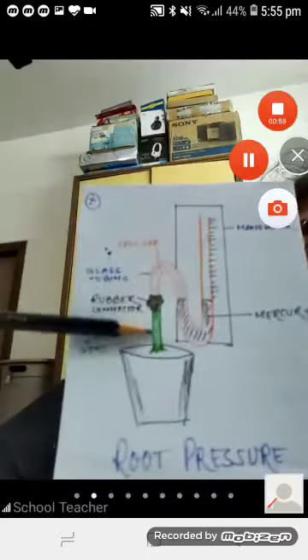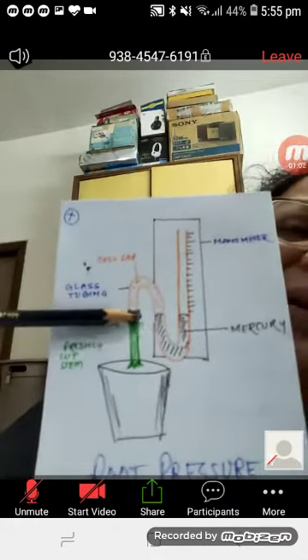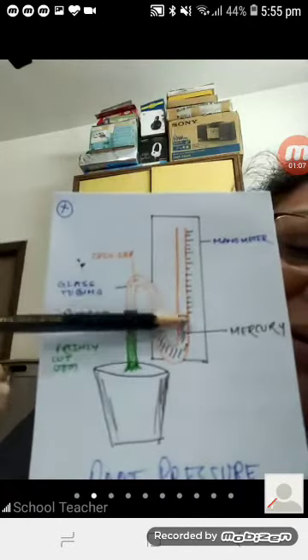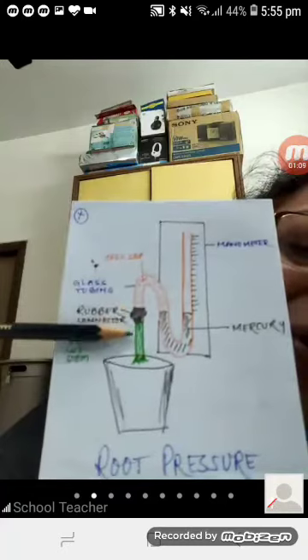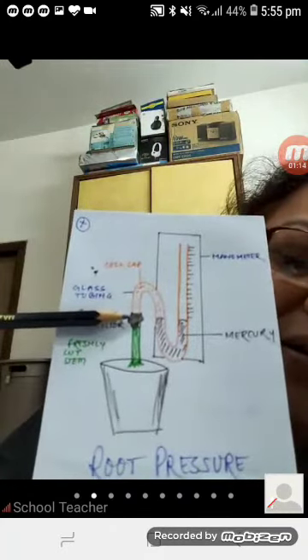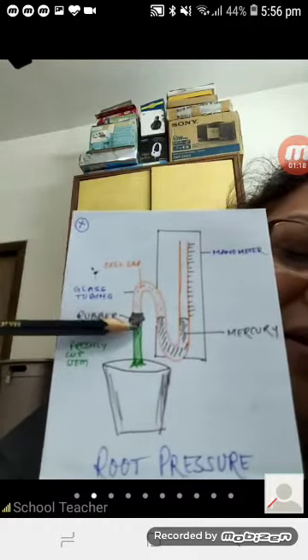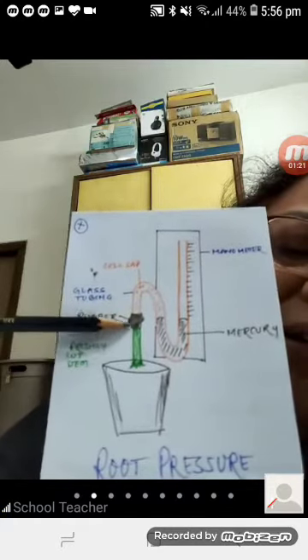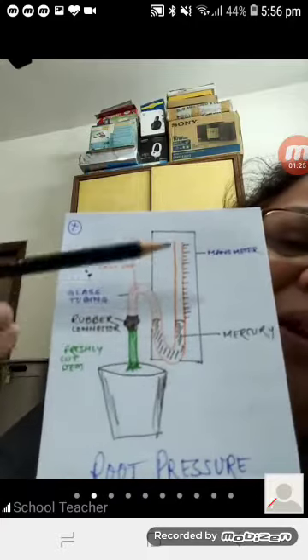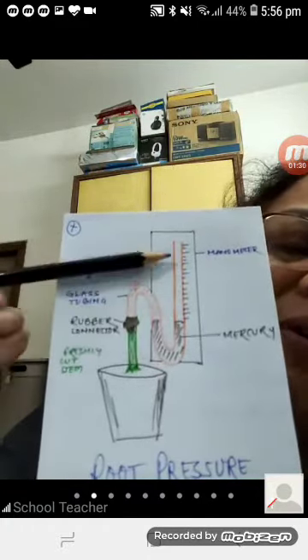This is a herbaceous stem that has been freshly cut. The glass tube is attached to a manometer with the help of a rubber connector. The manometer is the instrument which measures root pressure.